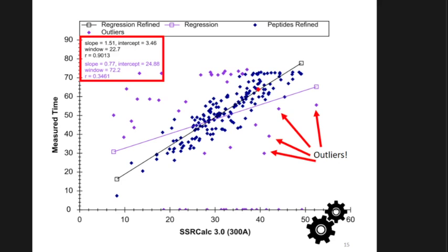One more question? Yeah. Is there any coefficient for modifications? Modifications don't change this at all. Each of these points would then be the modified peptide sequence. One more question on SSRCalc. Do you know if the regression will change based on what your runtime is, if you're running a shorter time? Absolutely, so that is excellent. We have a data set that we will be playing with this afternoon at 3. So pay attention, because you're getting quizzed on this at 3 with a data set that's exactly that. 7 different gradients, how does this change?